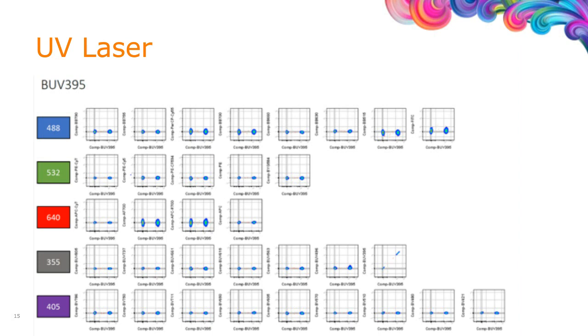And what we see here is a really good stain index separation between the negative population and the positive. And when it's punctate on the positive, that's really good. But when it spreads laterally, well, that could be a problem. So as you look at this, if you open up every channel, there's very little spread into any detectors, a little tiny bit into two of the detectors on the red line. But for the most part, that is a really good color.